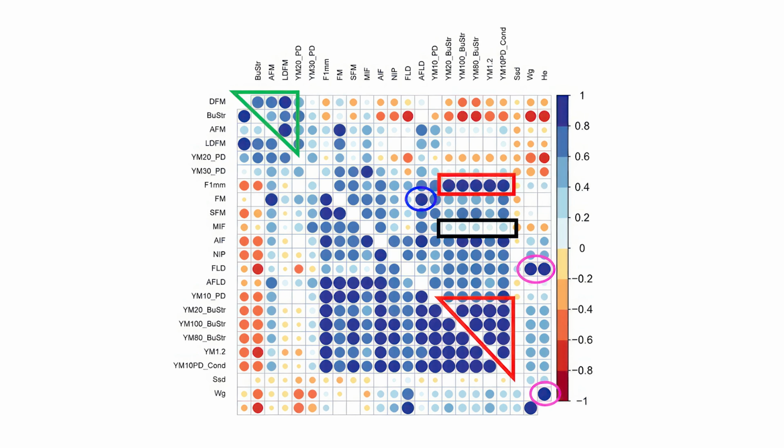Our recommendation is to use an instrument that can measure multiple texture components and not just one. Blueberry texture cannot be understood by just one component, so it's important to collect data for different components to evaluate different aspects of texture.